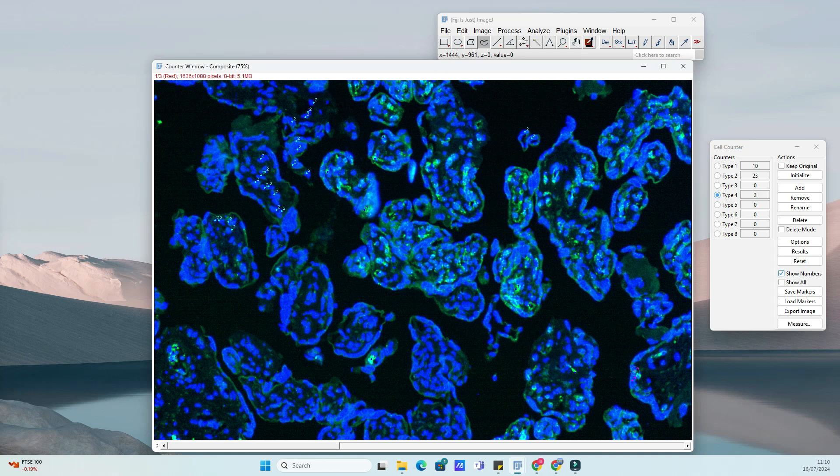Made a mistake? No worries. The plugin supports Undo and Redo functionalities, ensuring accurate counts without the hassle.